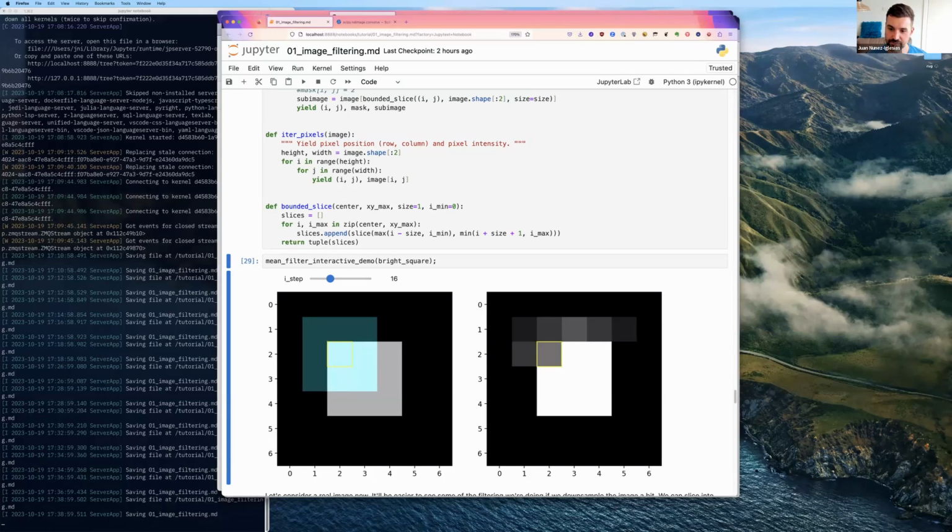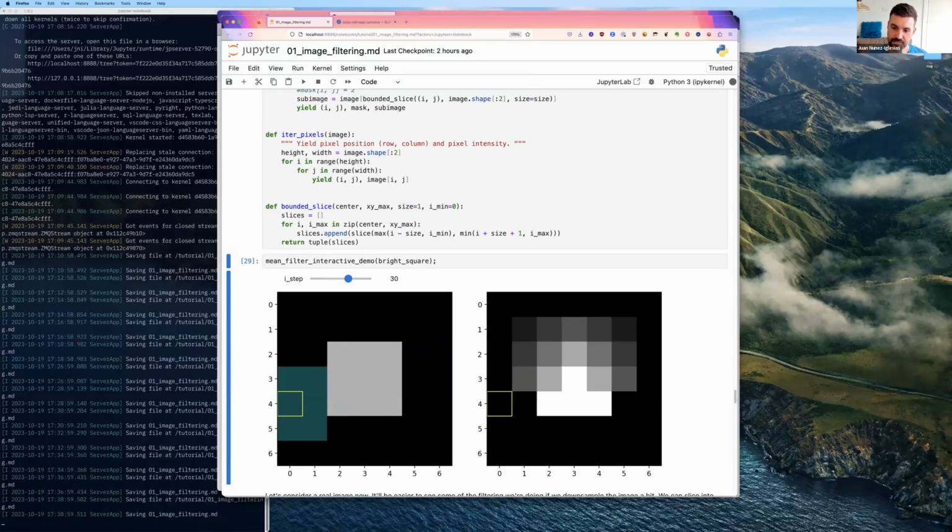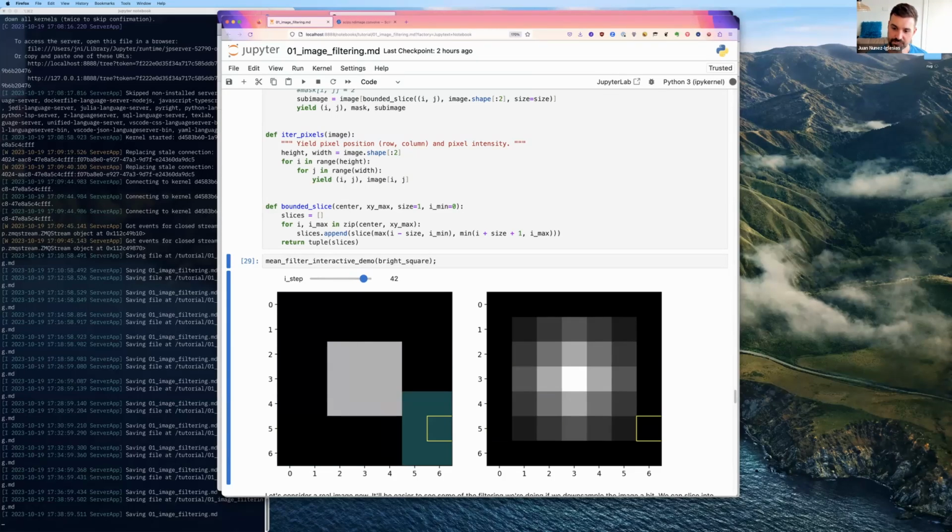And then here it's going up even higher. So this is now 2/9, same as here, 3/9, no, 4/9. And then this will be 6/9 because it's catching, let's go backwards. It's catching 6 pixels out of the 9 of the footprint. Okay, and you go along, and what you get is this little star shape. So just like before, it's taken our signal, which was very sharp, and it smoothed it, made it a little smooth splat.